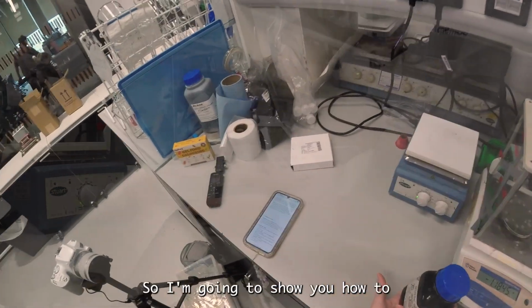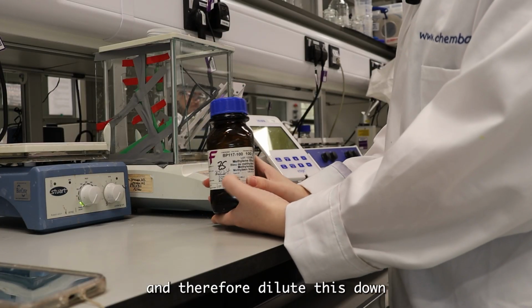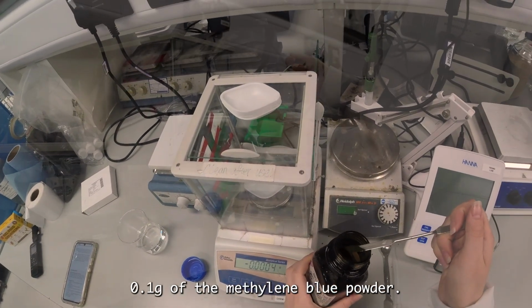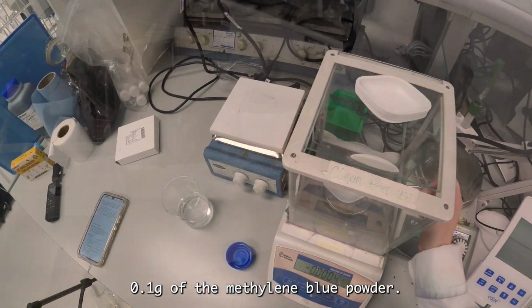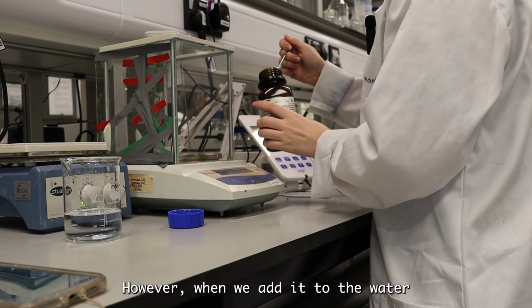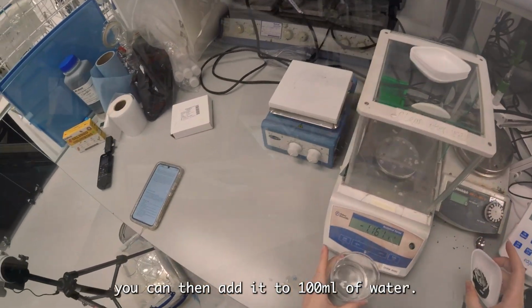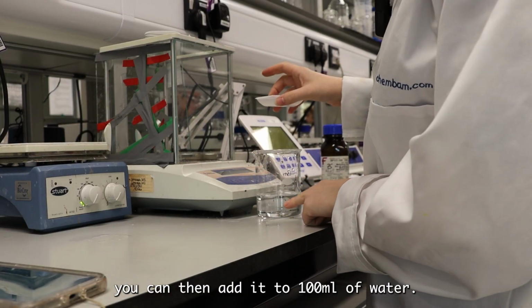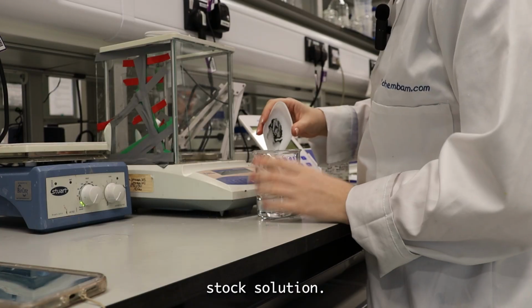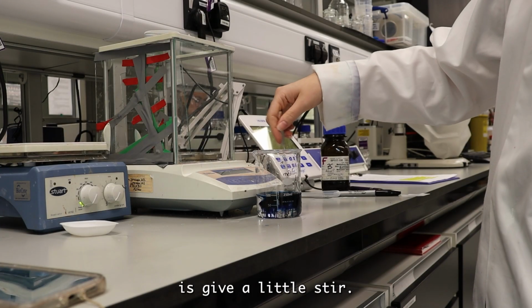It comes as a powder, so I'm going to show you how to dissolve it down, turn it into a stock solution, and therefore dilute this down even further. So first we're going to weigh out 0.1 grams of the methylene blue powder. This is strangely green, however when we add it to the water in a minute it should change colour. Once this is weighed out, you can then add it to 100 millilitres of water and this will make a very concentrated stock solution. It dissolves pretty quickly, so all you've got to do is give it a little stir.